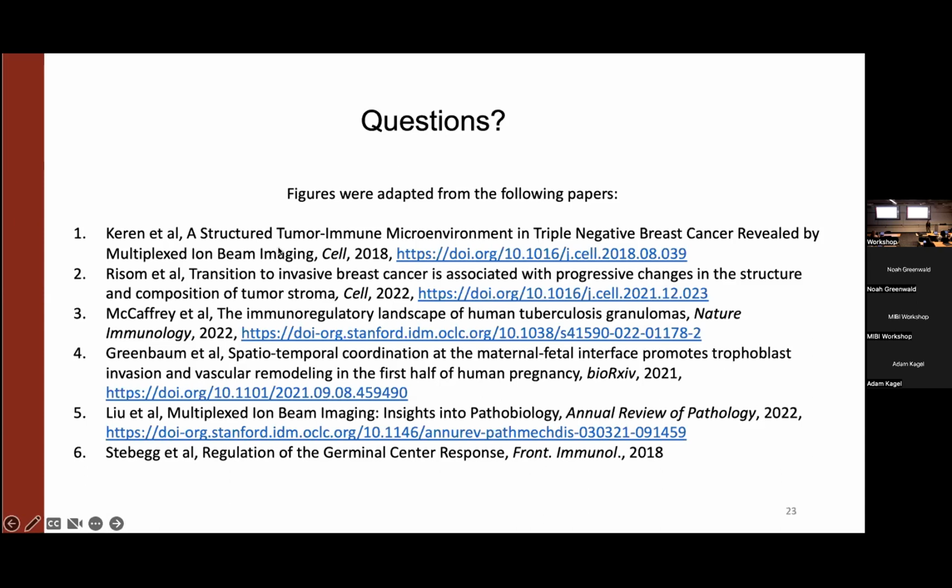Yeah, so the discussion was, what about if you have ECM pixel clusters or things that are never going to be within cells? How would you include it? And the short answer is don't know yet, but we'd like to. We'll think about it. We'd like to find out the best way to incorporate it. Summarize it somehow. And I think Candace is saying summarizing at the pixel level might be really data intensive, but if you could turn them into objects or neighborhood features, you could factor. They could be factored. If they can be labeled, they can be permuted.